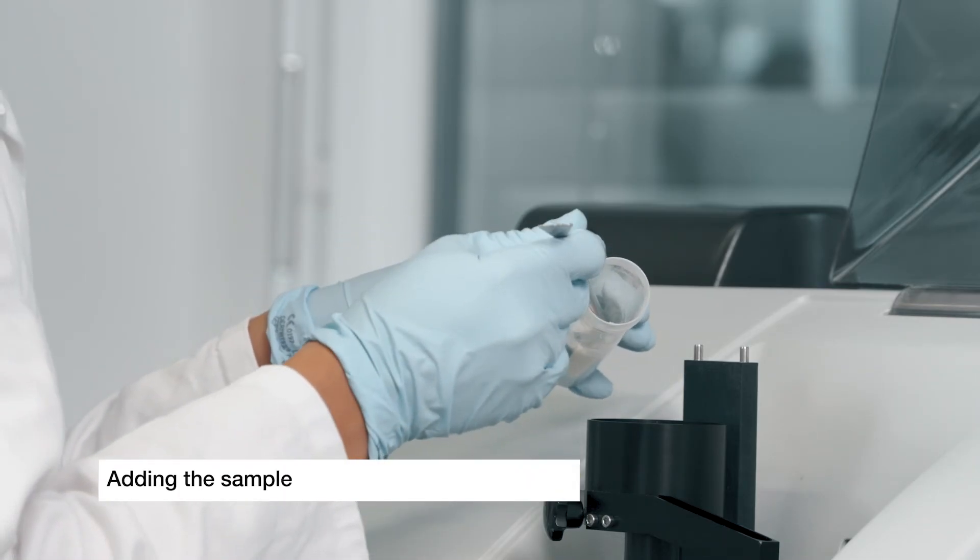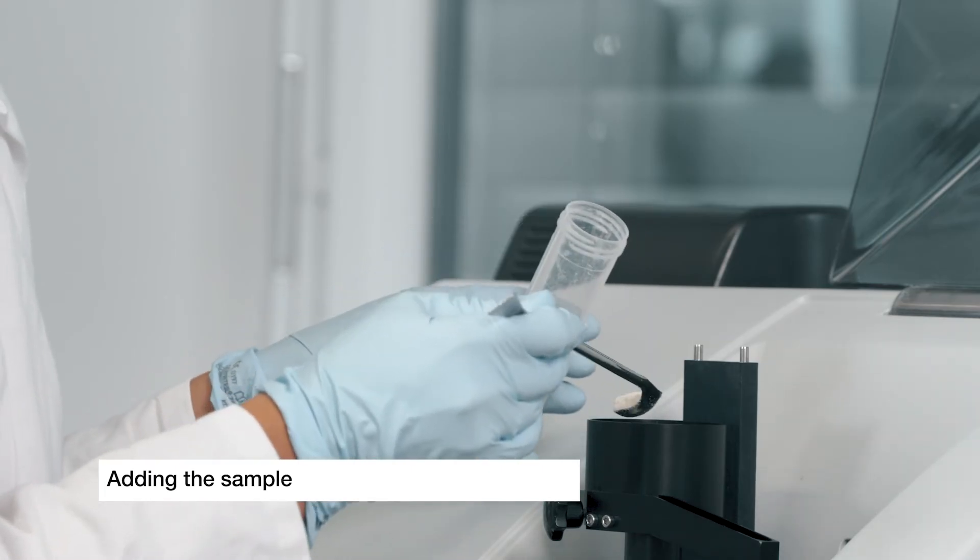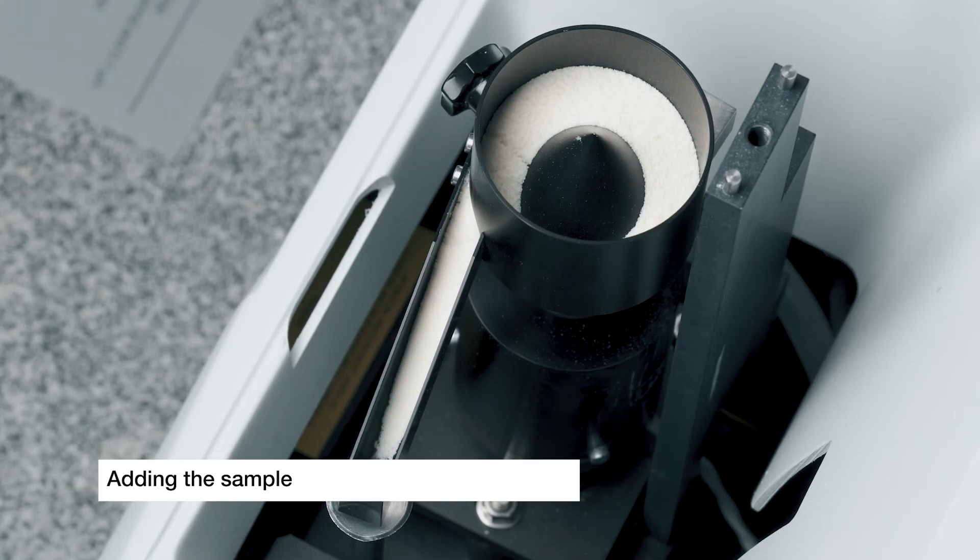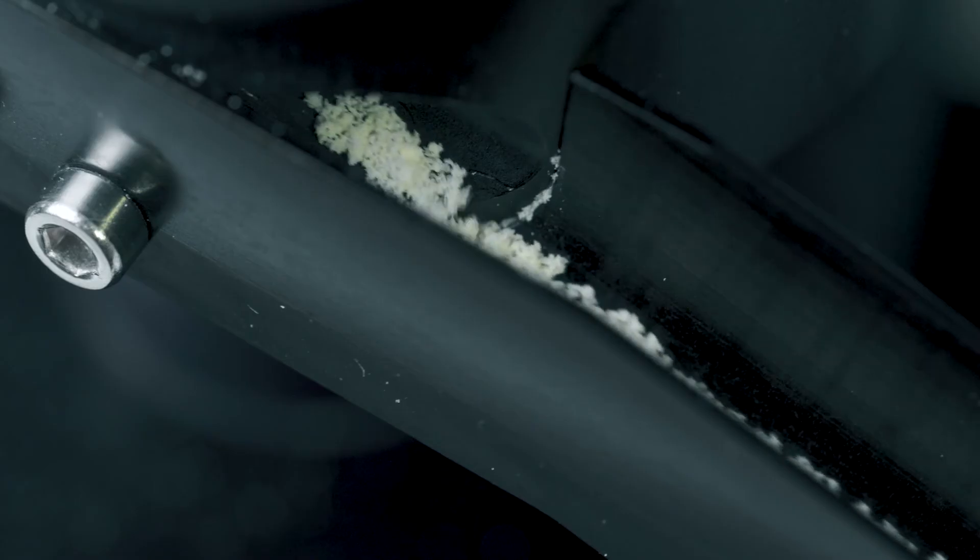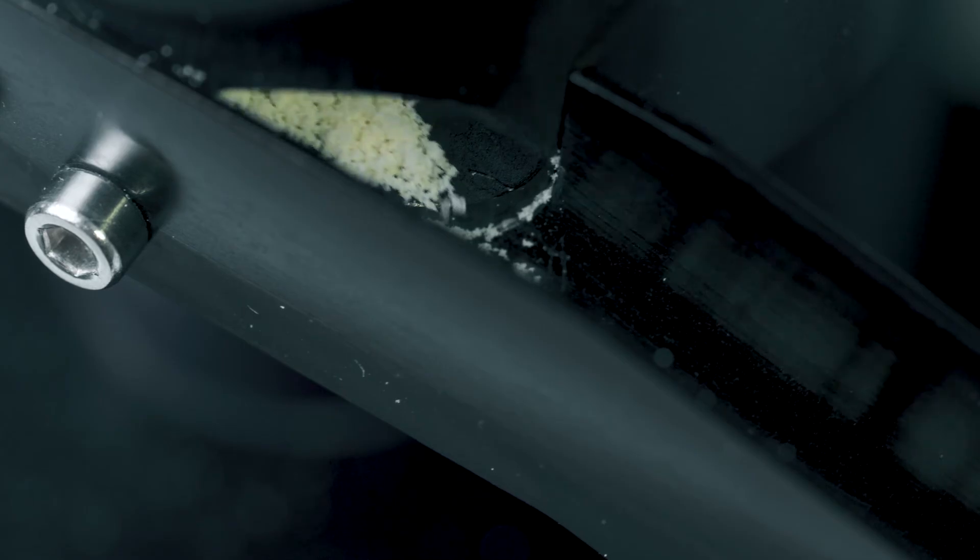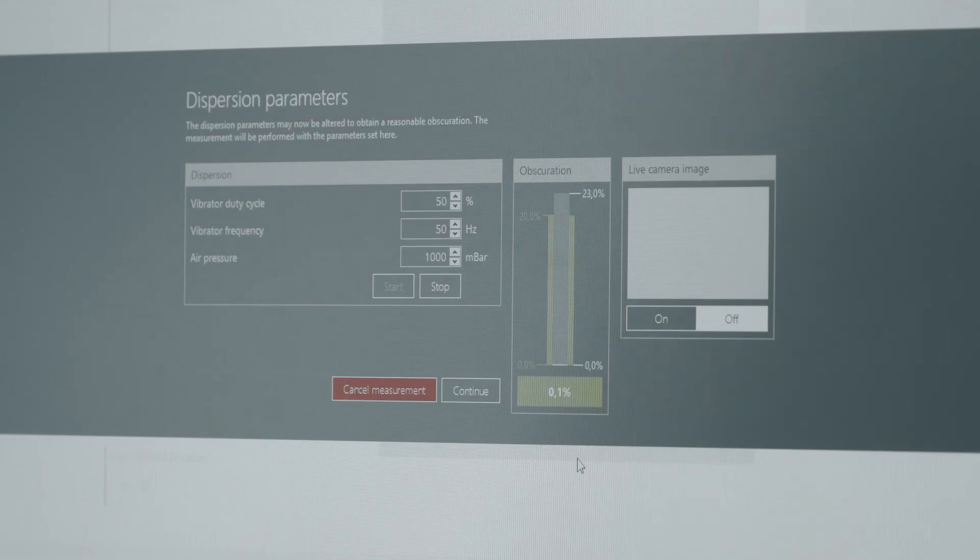After the background has been recorded, the sample is introduced in the sample holder mounted on a vibrational device. The sample flow is adjusted in combination with the air pressure in order to achieve the desired obscuration, which is clearly indicated by the software.